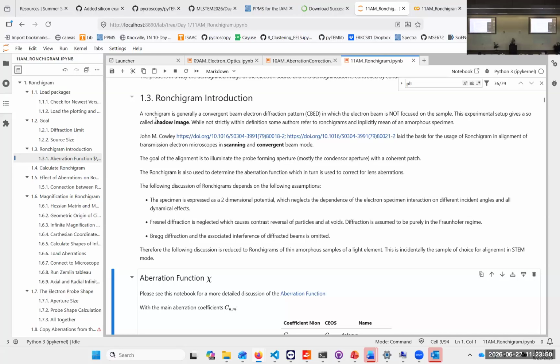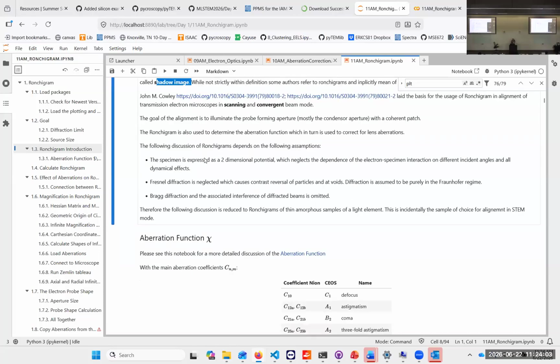And if you defocus that, we also saw that already, we have a shadow image. So we moved in between the image plane and the back focal plane. So we need to somehow get a very large area in reciprocal space where we can place our aperture on top.